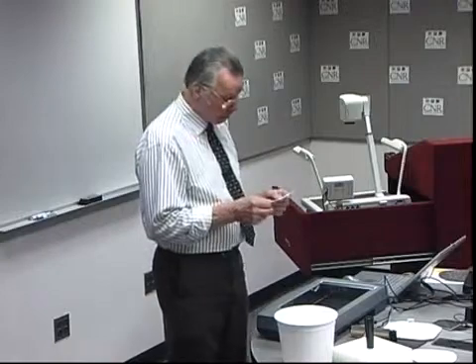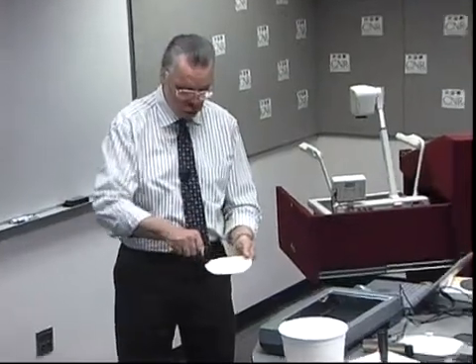Normally, this hand sheet is produced in a hand sheet mold. You put a blotter paper over the top of it and you couch with a heavy roller. By squeezing the excess water out, the hand sheet will adhere to the blotter.